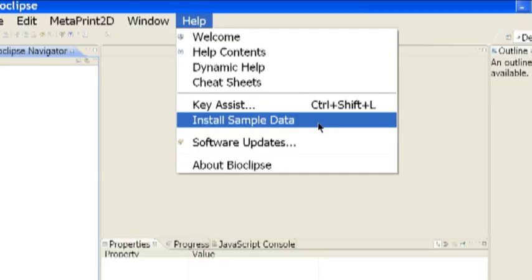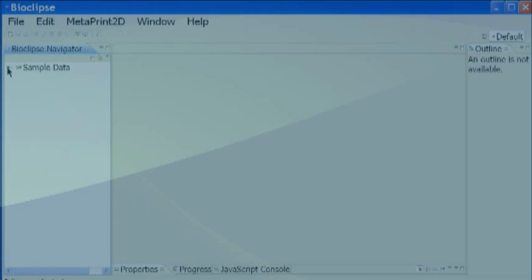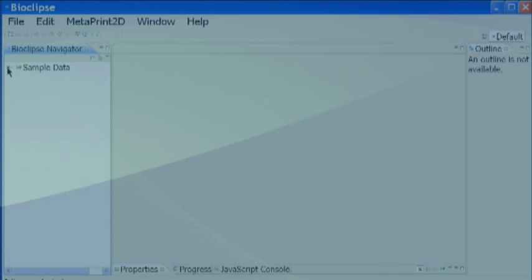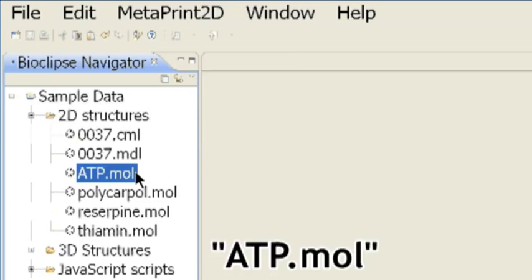Bioclipse can edit two-dimensional structures using JChemPaint. From the left navigator panel within the 2D structures folder, open ATP.mol to edit the triphosphate bond to a diphosphate bond.